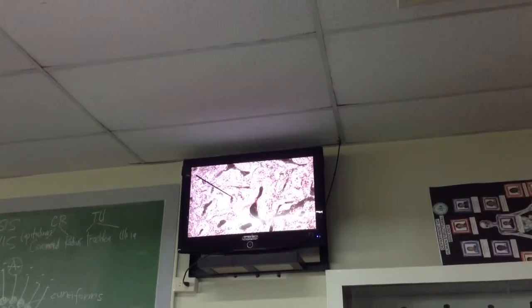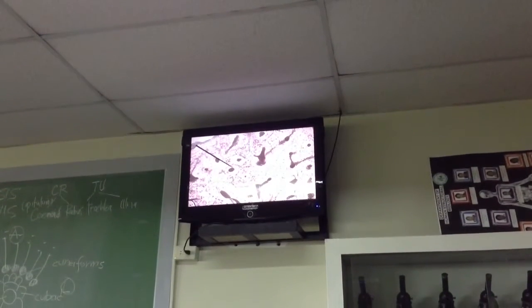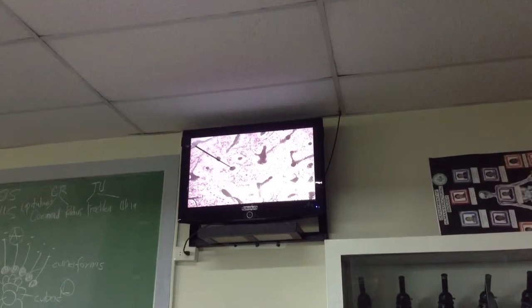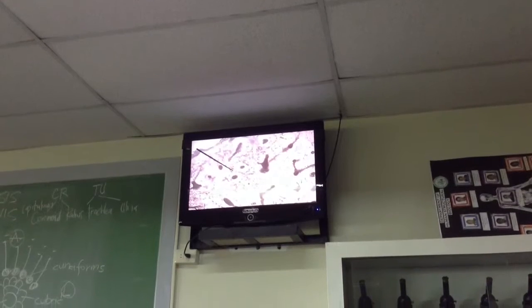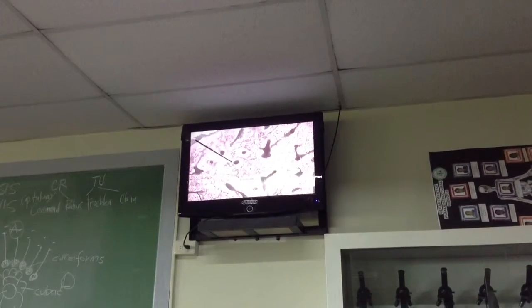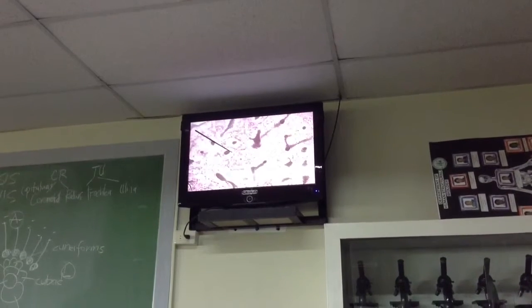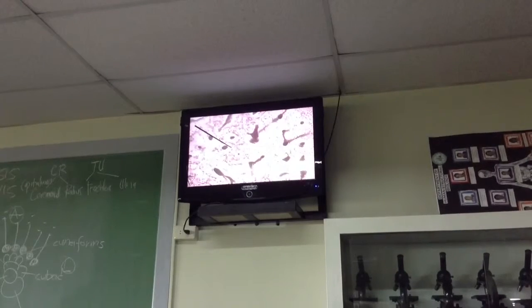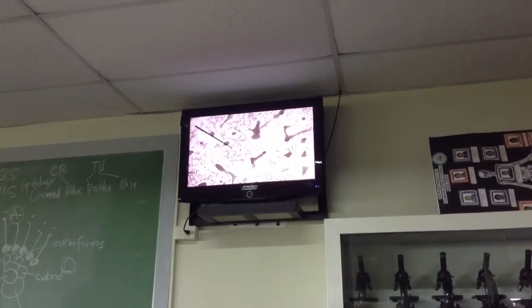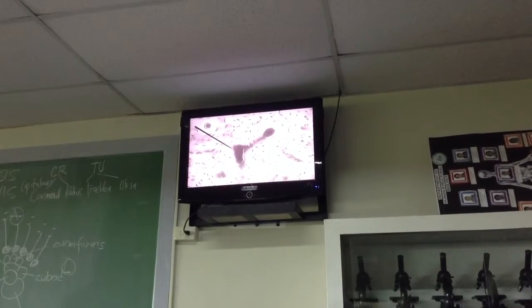So mukha siyang galaxy. So all this, the black holes you're seeing is what is referred to as the Haversian canal. Now, from this point to this point, this is known as an osteon, which is the unit of the compact bone. In the center of the osteon, you'll find there Haversian canal. So let's focus on one osteon at a low power magnification.